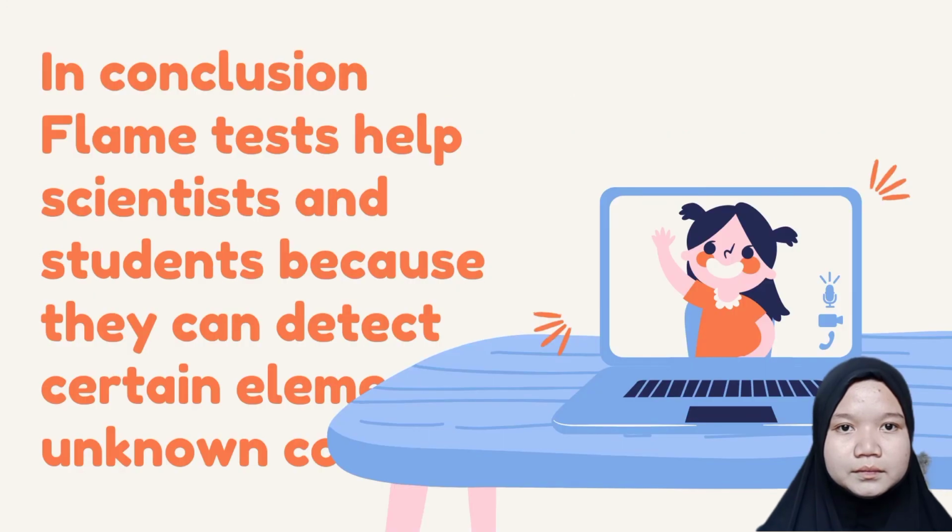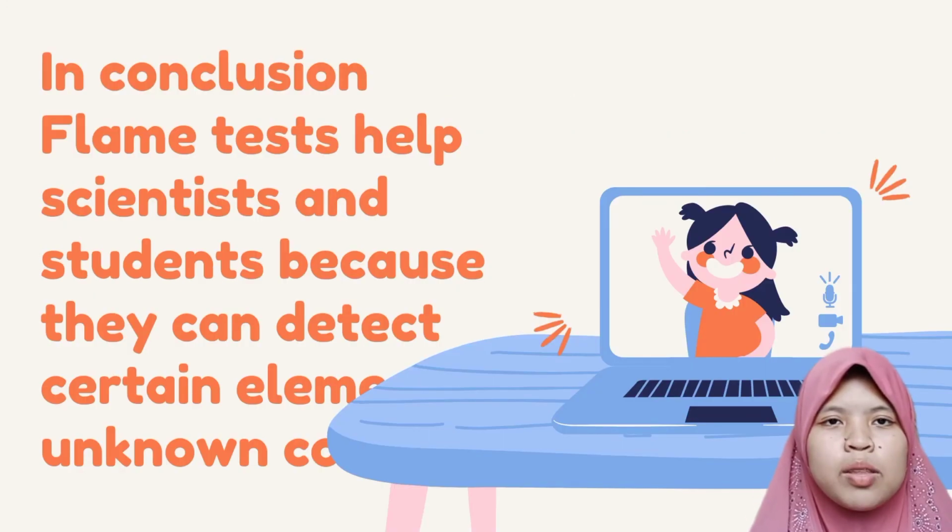In conclusion, the flame test helps scientists and students because they can detect certain elements in unknown compounds.